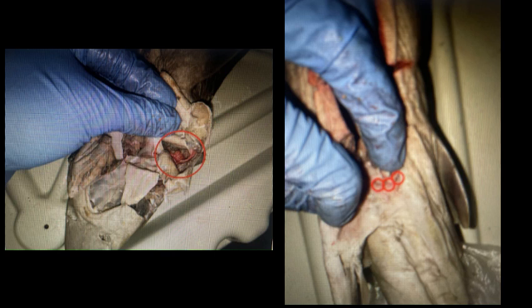The picture with 3 red circles points out the cloaca, the place between the claspers in the male sharks. Among them, the left circle is the urogenital papilla. A sac ejects sperm and urine. The red hole is the cloacal opening, which excretes feces from the digestive system, and the middle or the posterior one is the abdominal pore. Alright, these are 2 different pathways to eliminate waste in sharks.